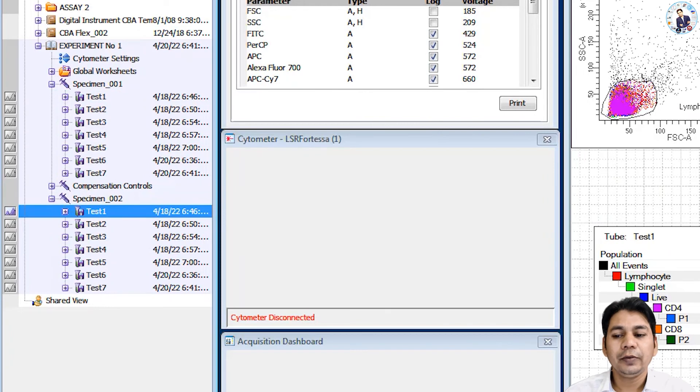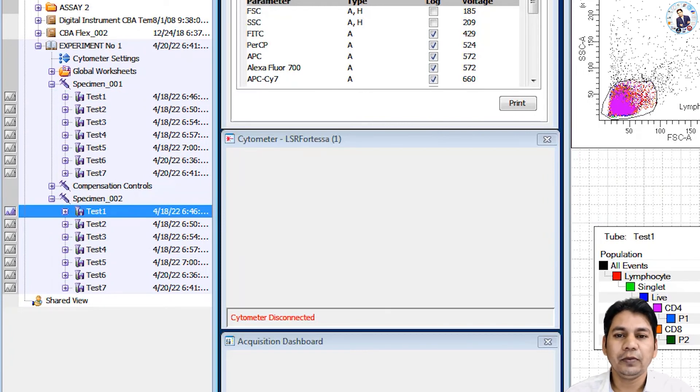So in this way, you can export or import FCS file from the FACS Diva software.